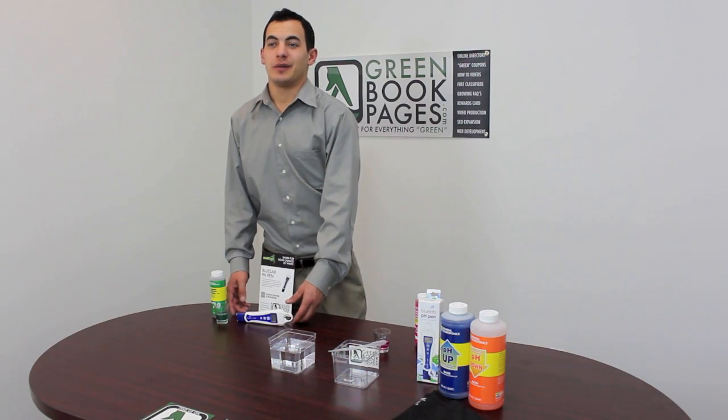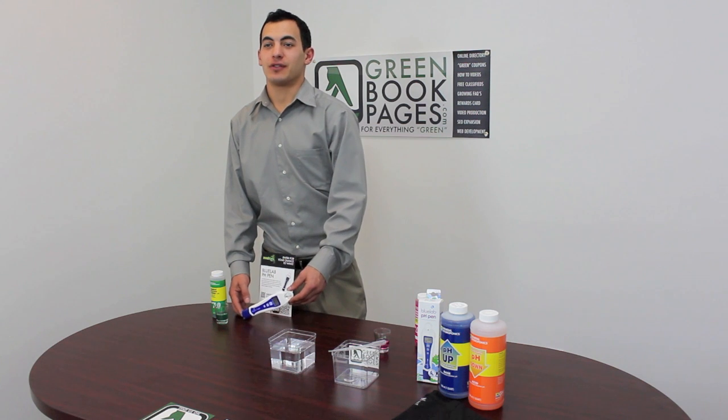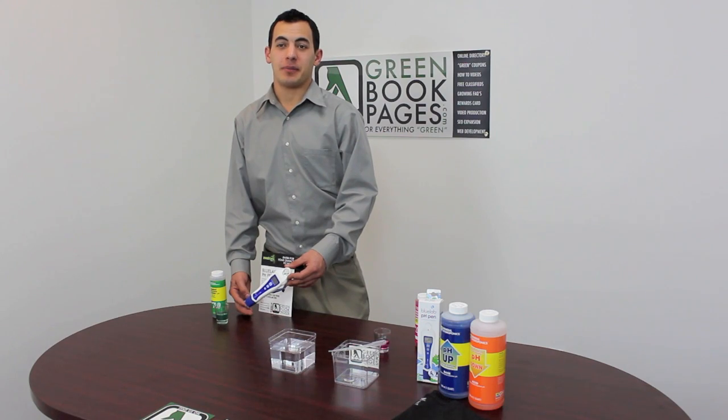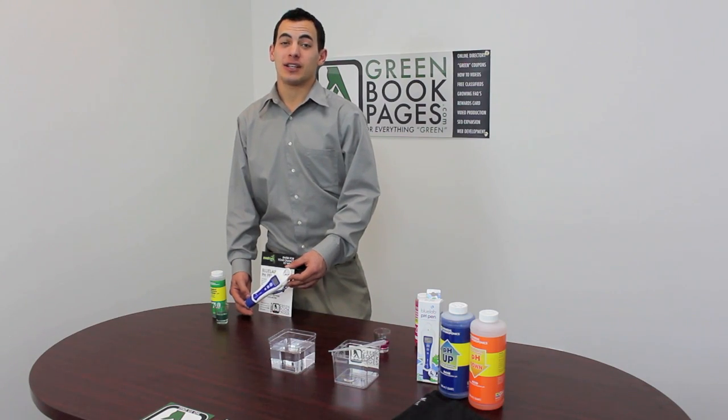Blue Labs pH Pen measures temperature and pH levels ranging from 0 to 14, and is accurate up to a tenth of the pH reading, automatically adjusting the pH readings to compensate for the temperature.